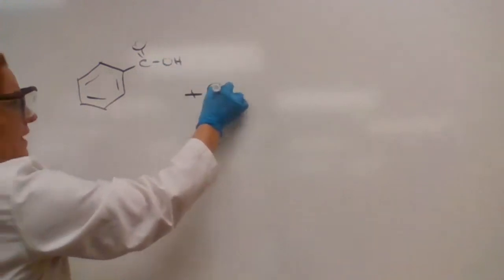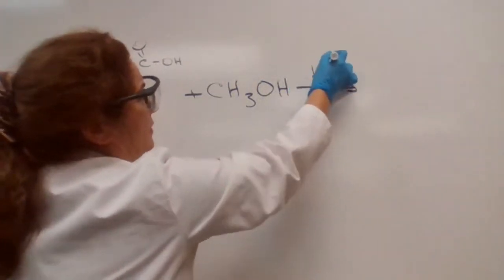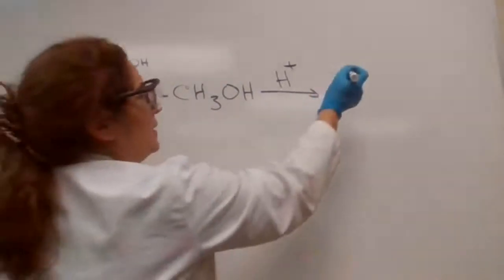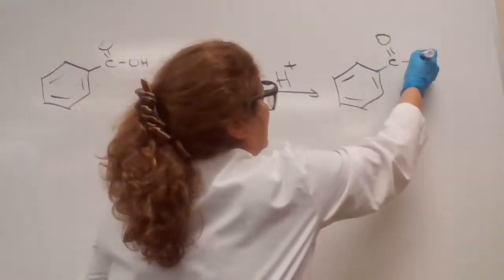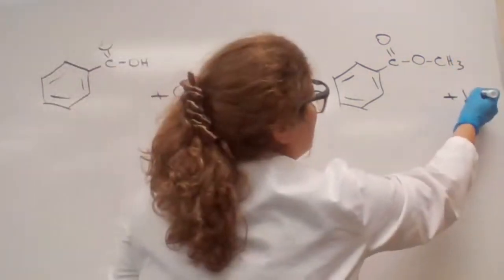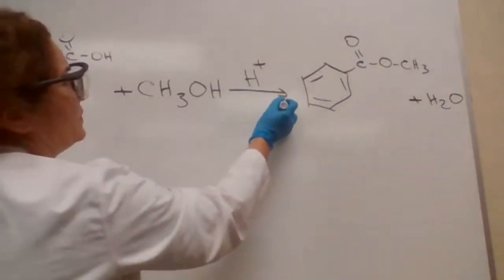Esterification of benzoic acid. We start with the benzoic acid. We add the alcohol, which was the methanol. Sulfuric acid, which we are using in this reaction, is just a catalyst. And the product, we actually get two products here, is going to be methyl benzoate and water. This reaction is a reversible reaction.